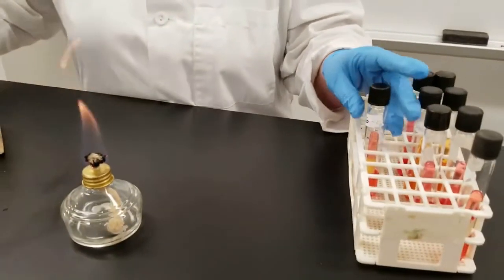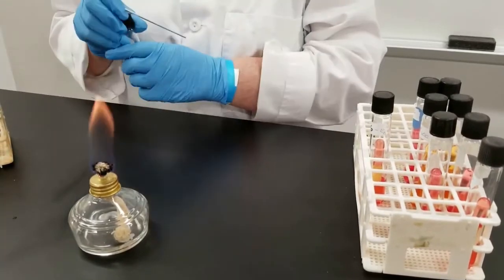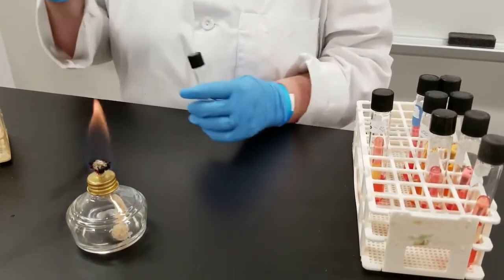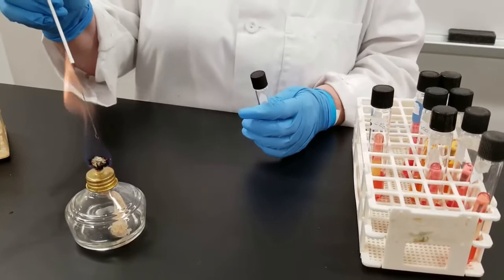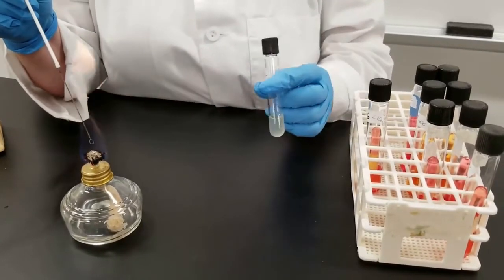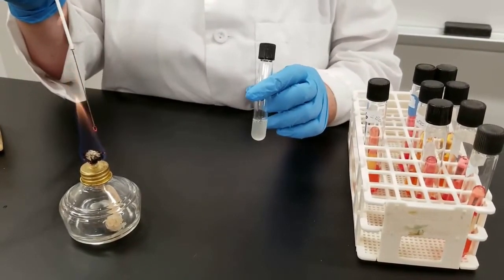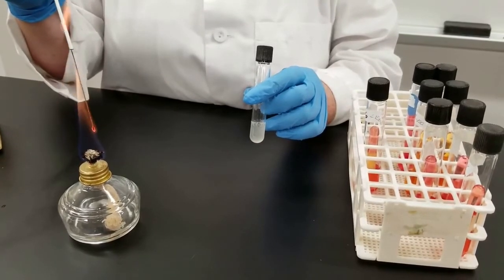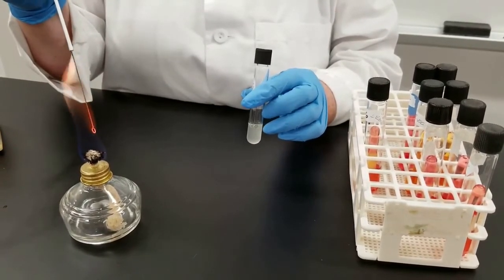To inoculate each of these, we're going to use two different cultures. We will use E. coli and Proteus vulgaris. And so we're going to inoculate. We have the initial culture in a liquid broth and I'm going to go from that liquid broth into each of those tubes.